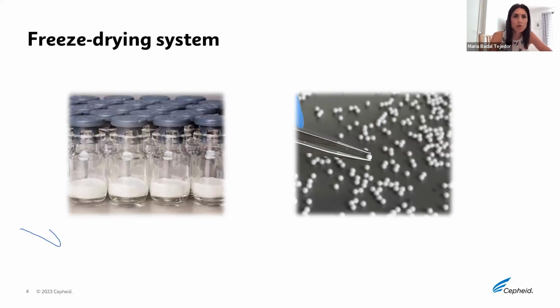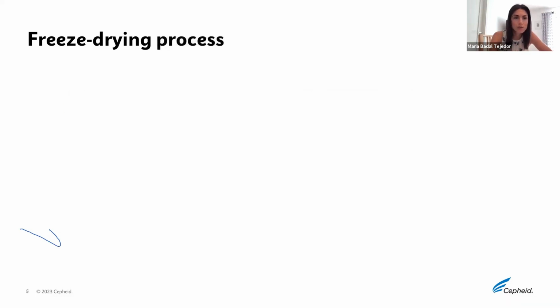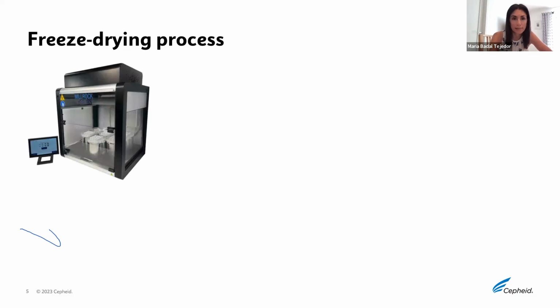And we will also have another requirement for the LyoBeads, because we want to handle these beads. These beads will be transported later on, so we need them to be stiff enough to not break on the way. So let's look at the freeze drying process when we are handling beads.